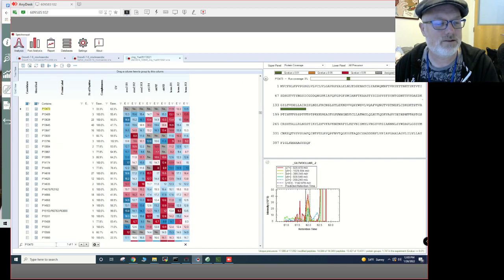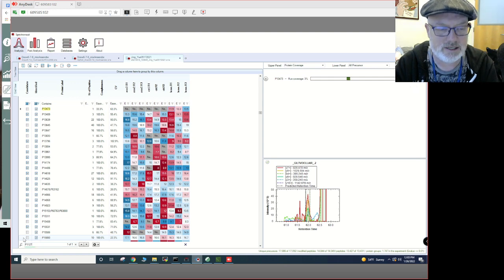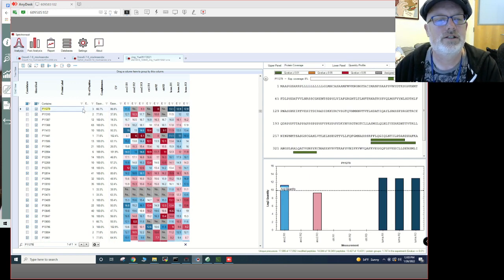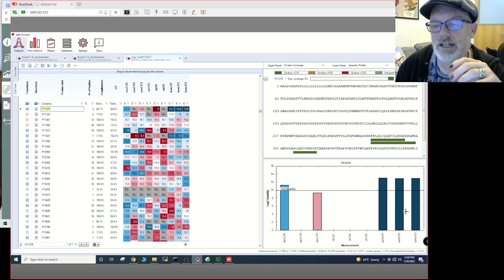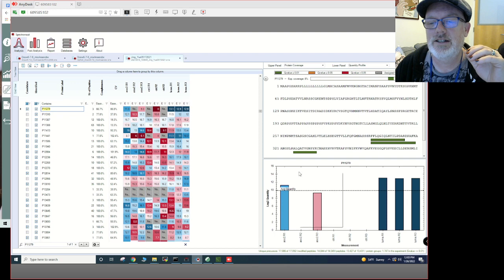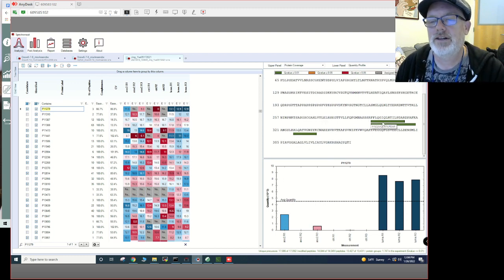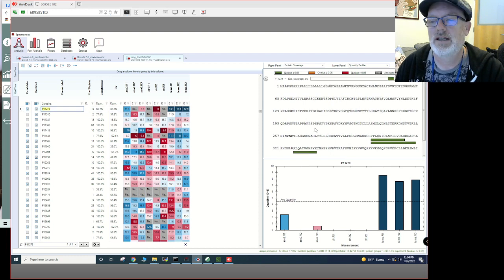Okay, so let's look at our second protein, and that is P11279. That one shows up. You can see how there's solid evidence for it in the LLUME samples, but you see some does show up in these other group of samples here. If we turn off the log scale, you can see more how intense they are in the LLUME and not very intense in these samples. So in this protein, we have 3 peptides, so it gives us a little bit more to work with.